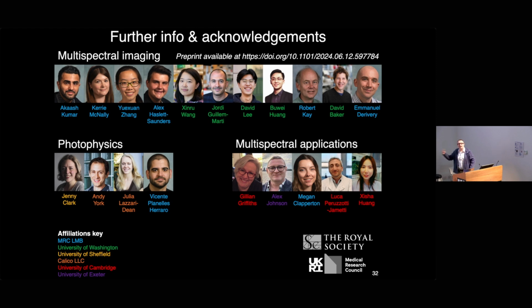If you want to go higher than that, then you'd have to use some kind of barcoding strategy where you've labelled it with multiple colours, but the number that you see also tells you some information about what you've labelled.